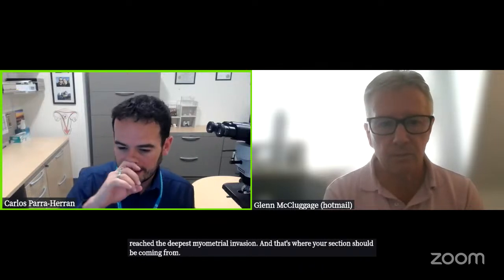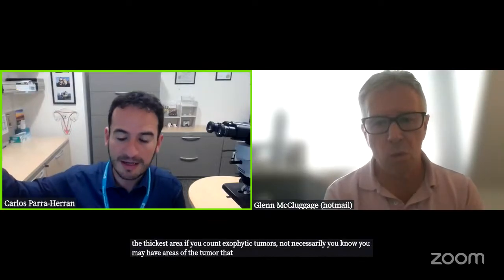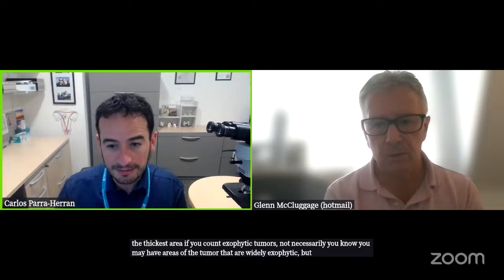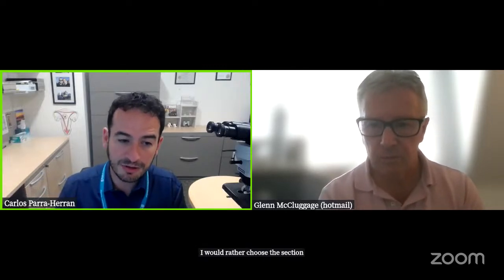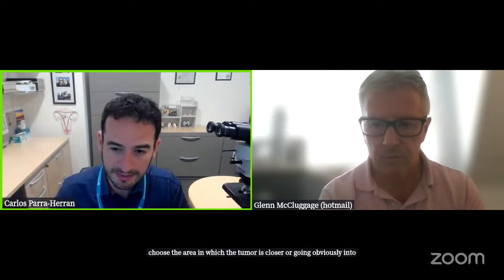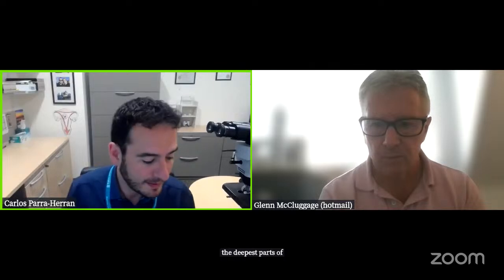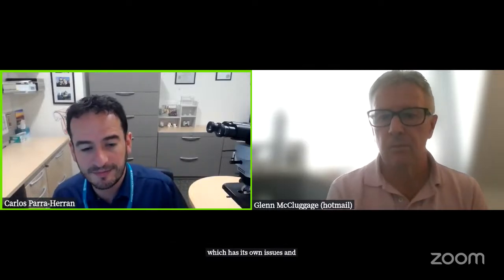Whether that's the thickest area, if you count exophytic tumors, not necessarily. You may have areas of the tumor that are widely exophytic, but not as deep into the wall. I would rather choose the area in which the tumor is going into the deepest parts of the uterine wall. And then you confirm that by microscopic examination, which has its own issues and disadvantages.